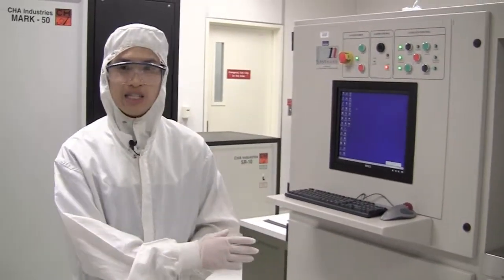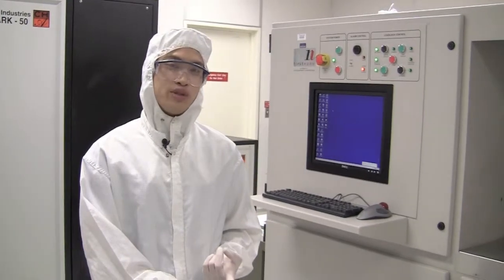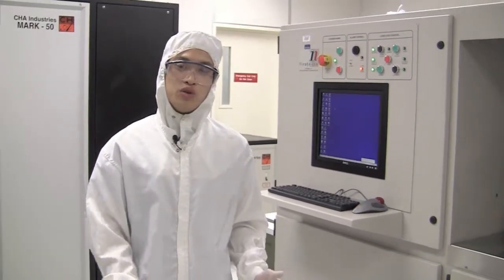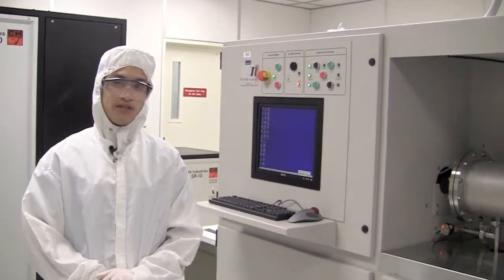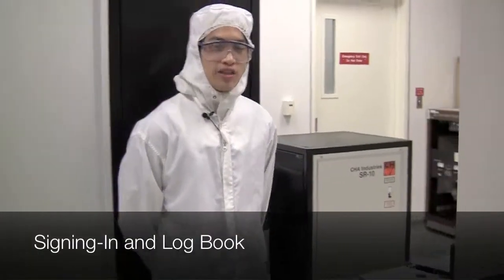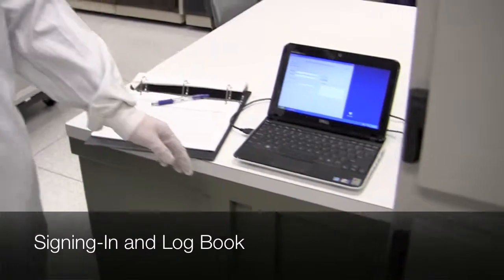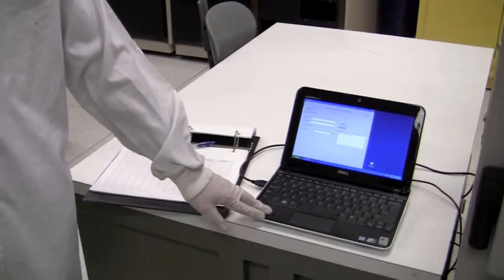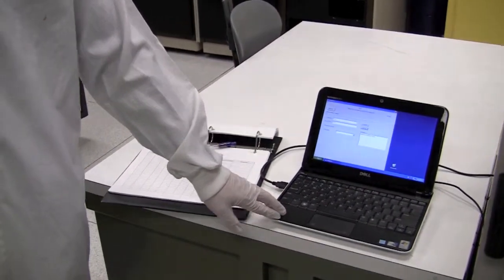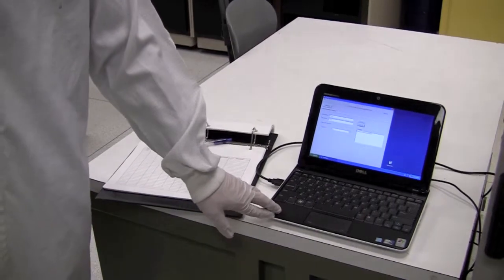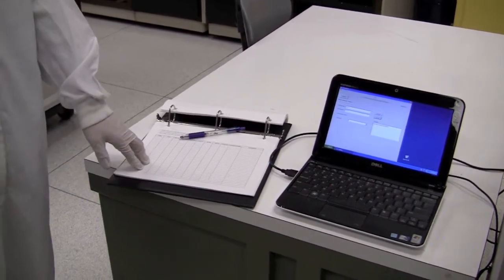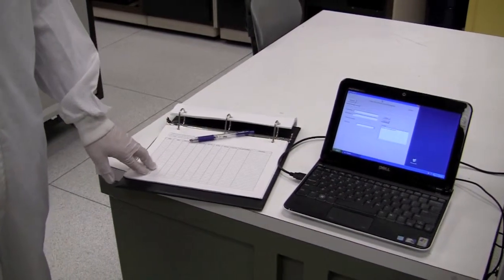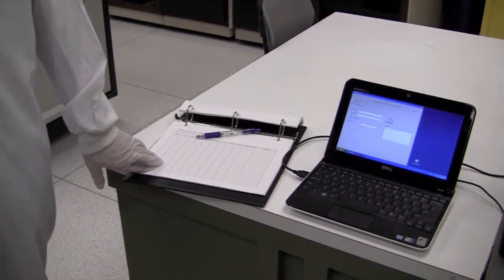I want to highlight specific hazards associated with the tool in addition to safety mechanisms built into it to help us operate safely. We're going to sign in on the cleanroom computer with your username and password. In addition, we want to fill out the logbook every time you use the furnace for information such as gas cylinder pressure.